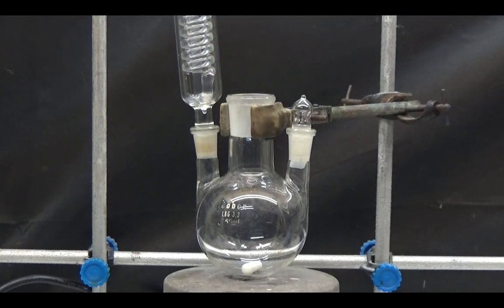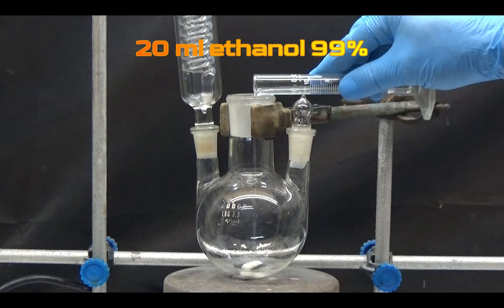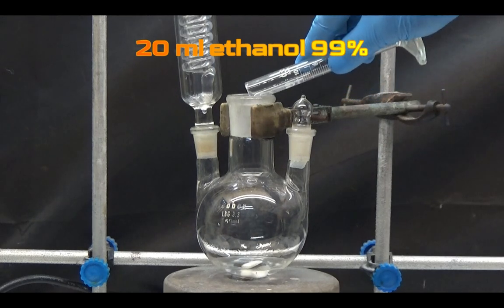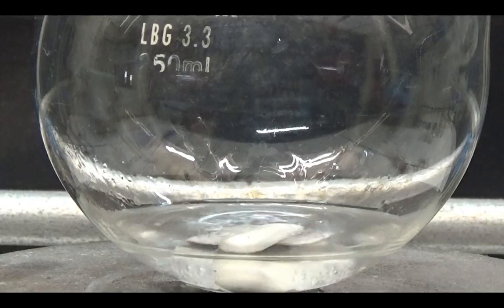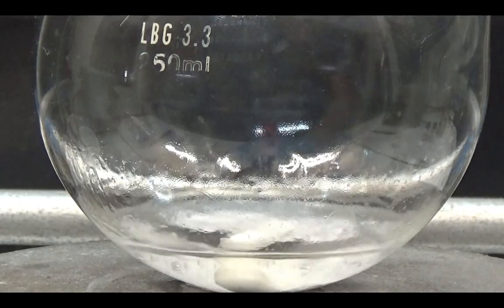In a three-necked flask with a reflux condenser and a thermometer, we put a stirring bar and add 20 milliliters of 99% ethanol. The sodium is added slowly and we wait for it to dissolve. To accelerate the reaction, we can heat it a little.